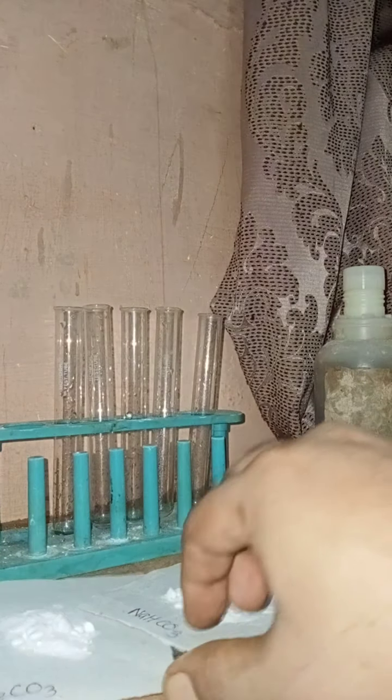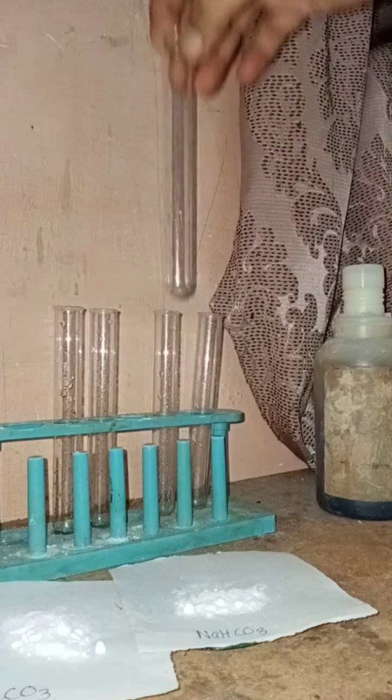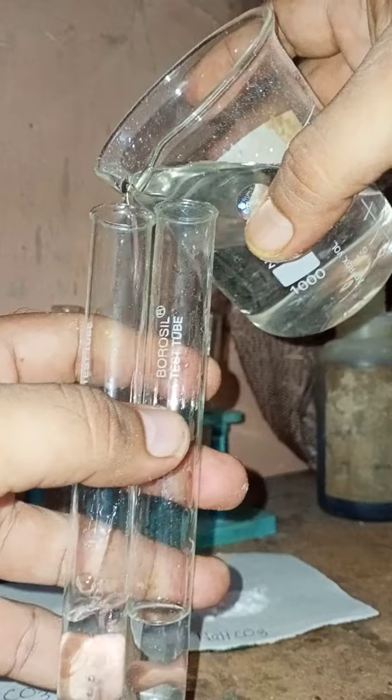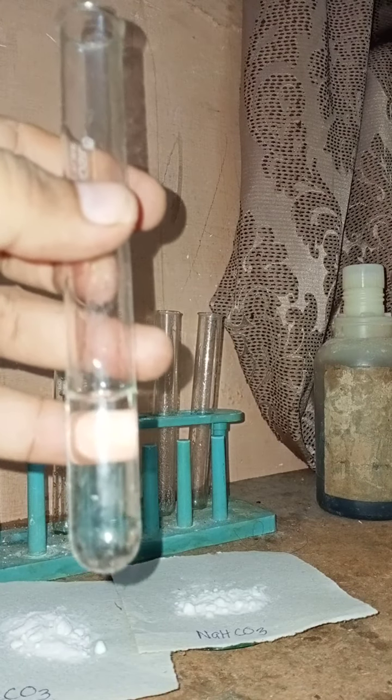And now we are going to prepare the solution of these substances. For that we have taken two test tubes. You can see these test tubes. In these test tubes we are going to add water. This is the distilled water that we have. You can see we have filled the test tubes with water.